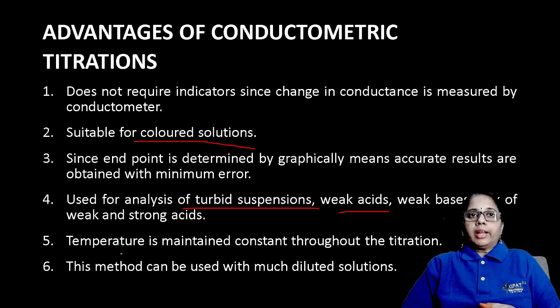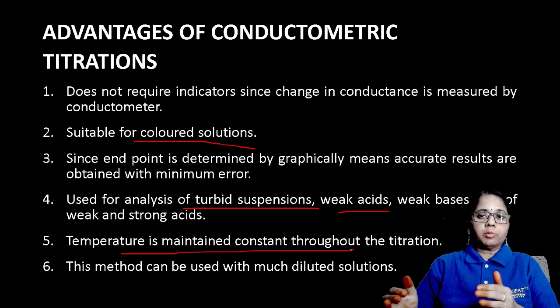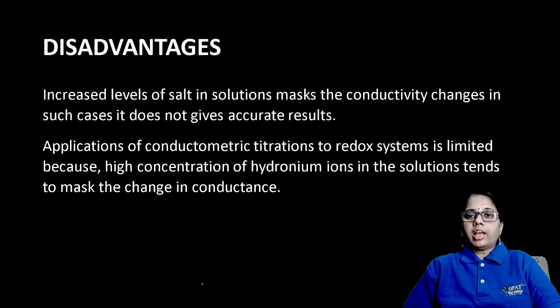Temperature is maintained constant. You need to keep the conductivity cell in a thermostat, so that constant temperature can be maintained. This method can be used with very dilute solutions also, so we can estimate the amount of analytes present in highly diluted electrolyte solutions.